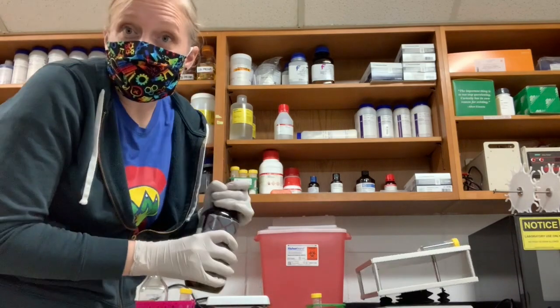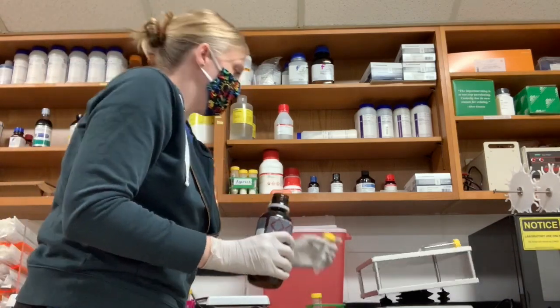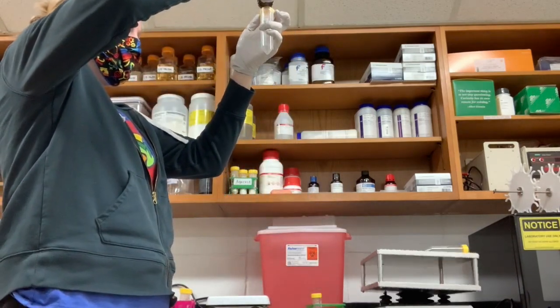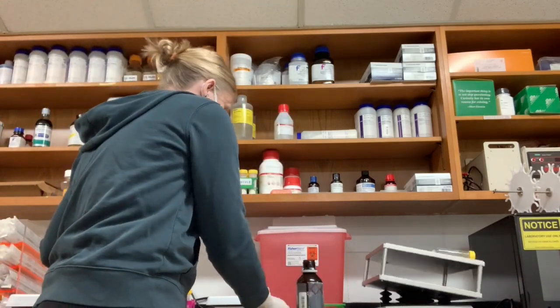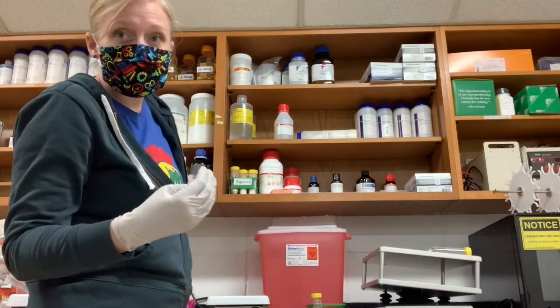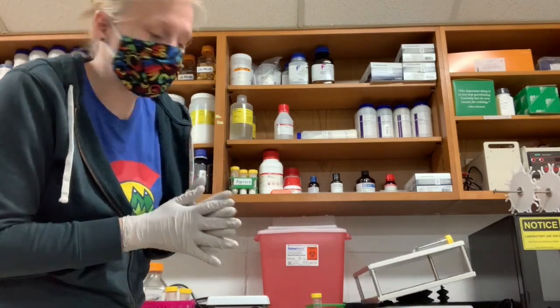I'm going to do the same thing for Triton in a separate tube. If you accidentally pour out too much, please don't pour it back into the bottle. You can just pour it out in the sink or pipette out a little bit of waste if you need to.